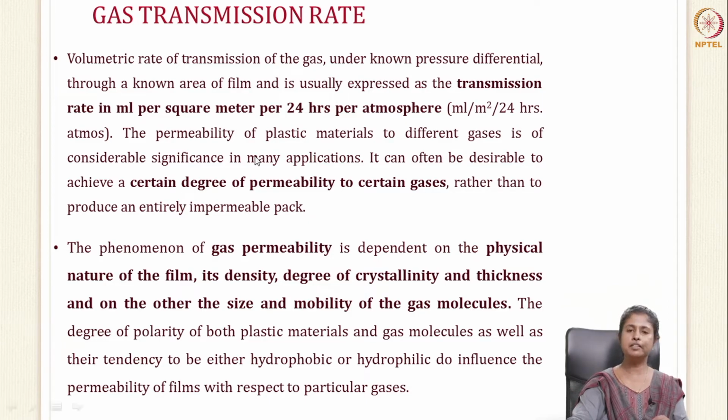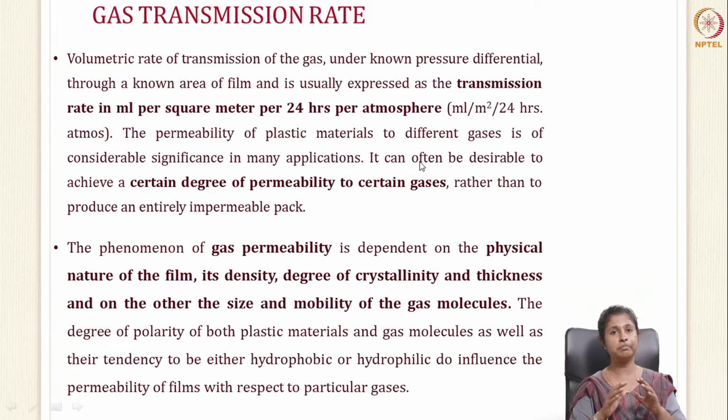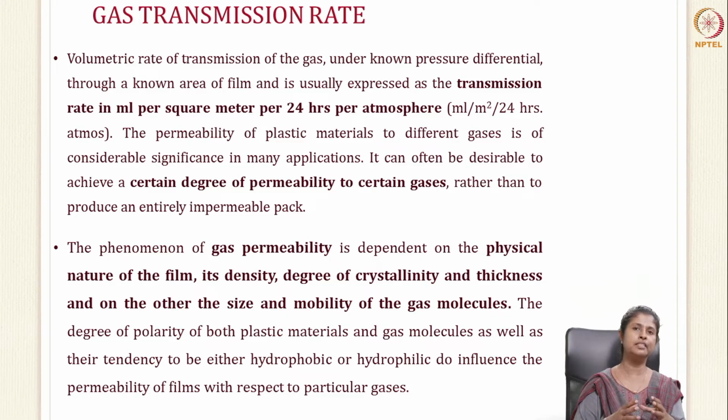Now, the permeability of the plastic material to different gases is of considerable significance. Usually, instead of considering all the gases and making the package completely impermeable, it's important to consider the permeability of your packaging material to certain gases. Maybe it is for oxygen, or how impermeable or permeable it is to carbon dioxide. You go in for specific gases. That gives you a better idea based on your product and the package that you want to design for it.